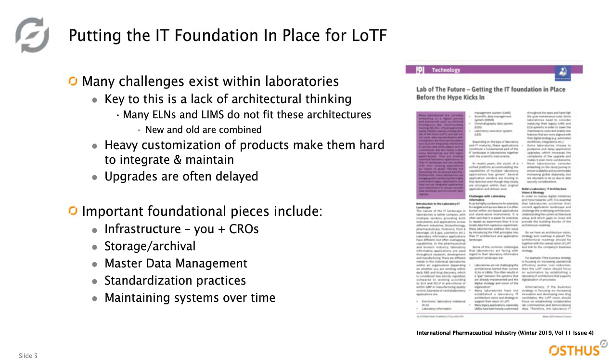Storage and archiving is another big issue. The idea that you just lock this away can be a problem. The master data management piece is key, and standardizing practices is another really big part that we bring in from the semantic side. And then finally, you have to think about how you're going to maintain these systems over time.